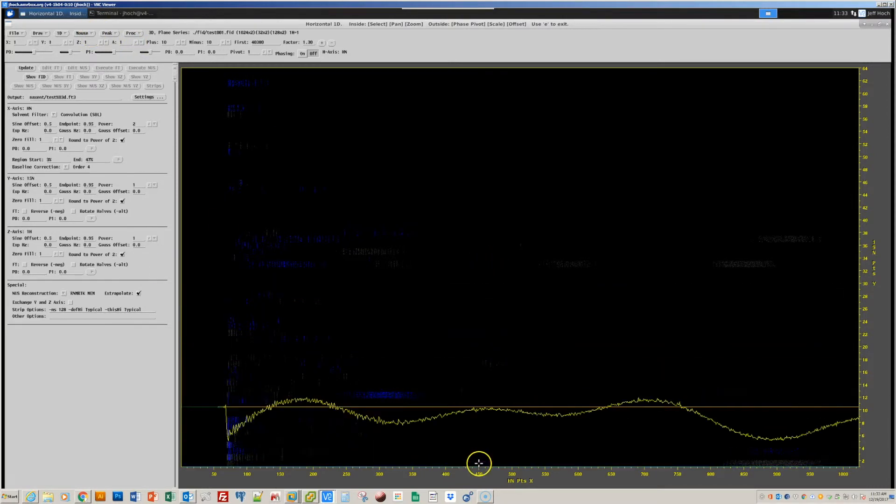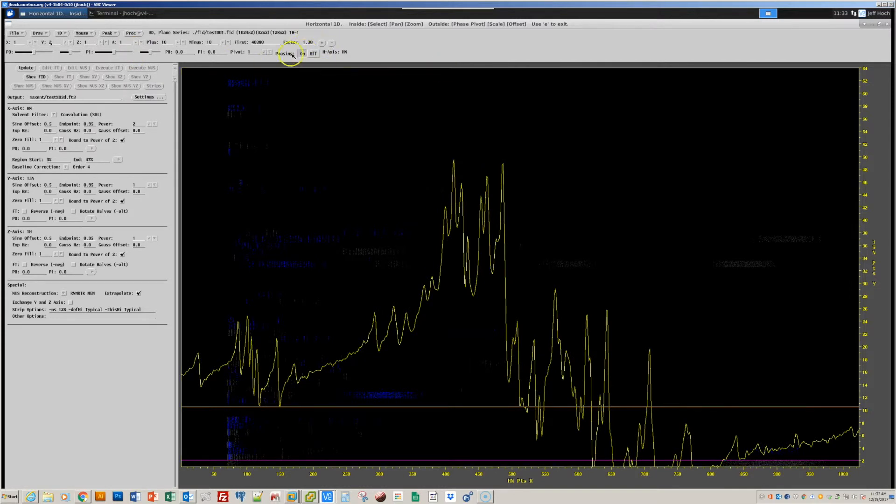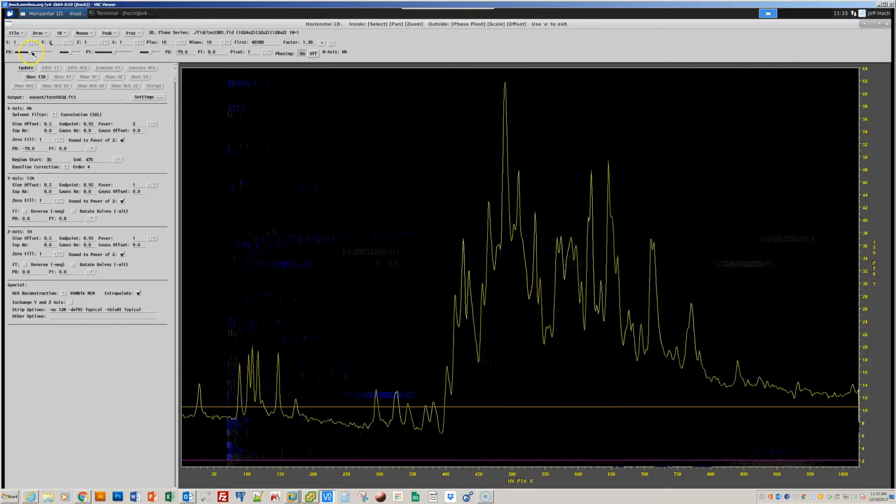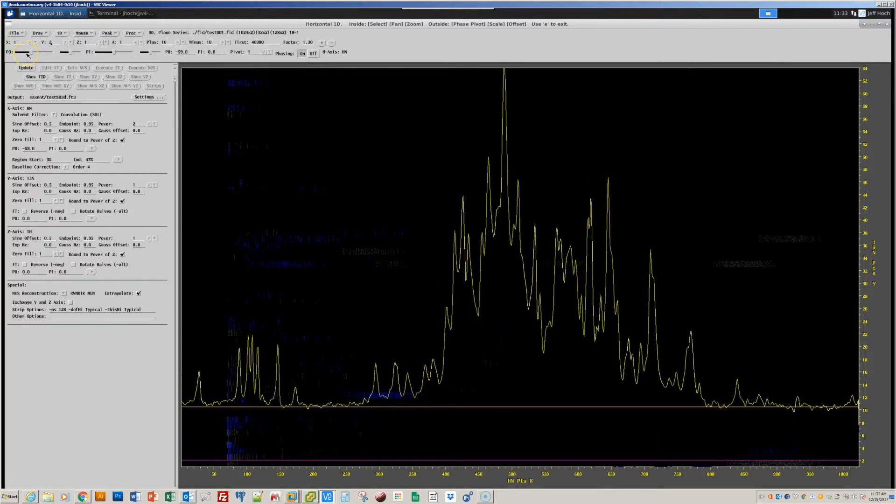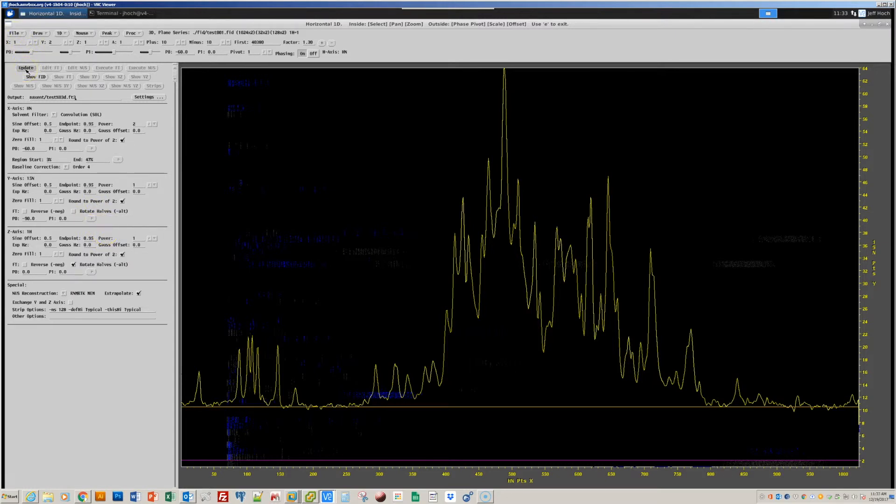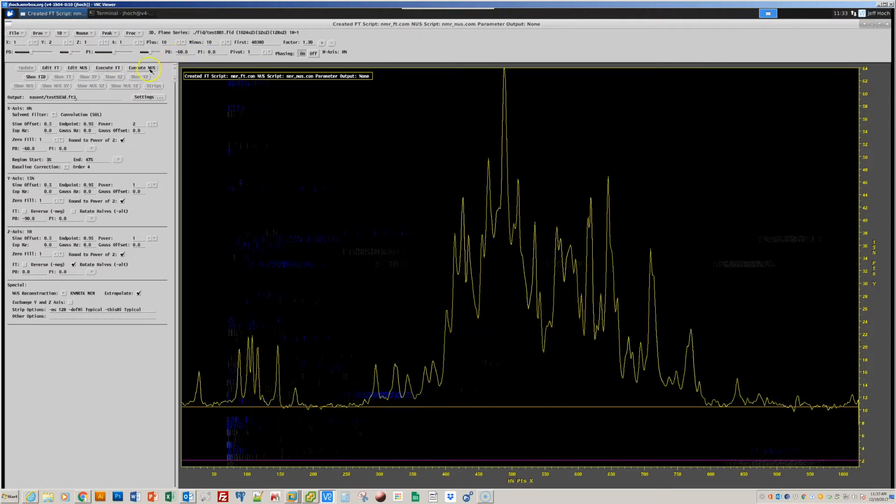And so, we can go through the steps like before, choose a 1D, process it, quickly choose phase correction parameters. Update the corresponding script. And now, I'll execute the non-uniform sampling script. And if we want to, we can see what this maxent script looks like. And it's actually pretty simple. It just runs a script called maxent3d, with the different parameters like the phase correction values that we've determined. So, I'll execute that scheme.